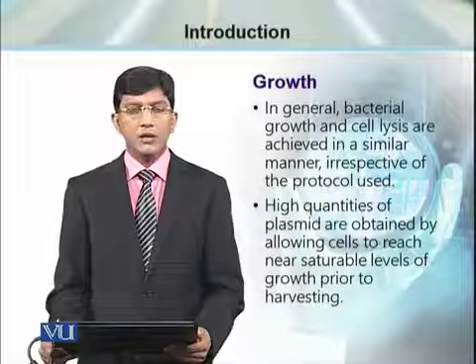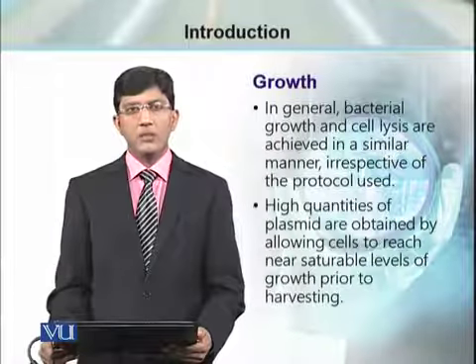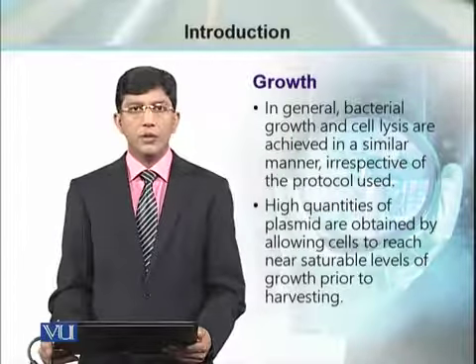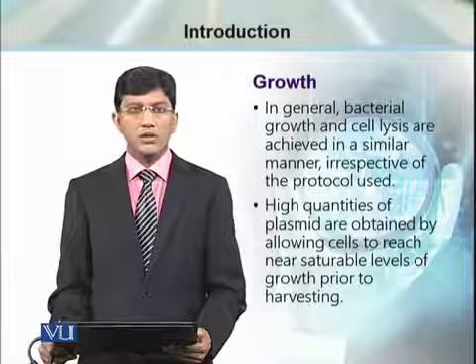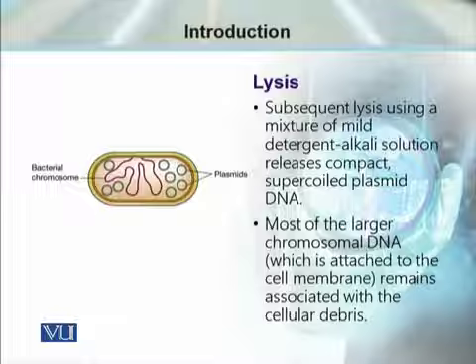In general, the bacterial growth and lysis follows the same pattern. We grow bacteria in the same manner as we did for the mini-prep, and we can use the same bacteria for maxi-prep. However, to yield high quantities of plasmid DNA, we should ensure that the bacterial culture has reached a saturation level. After the saturation level is achieved and the harvesting is done, the lysis of the bacterial cell can be done using a mixture of mild detergent and alkali solution that is going to release the compact plasmid DNA.